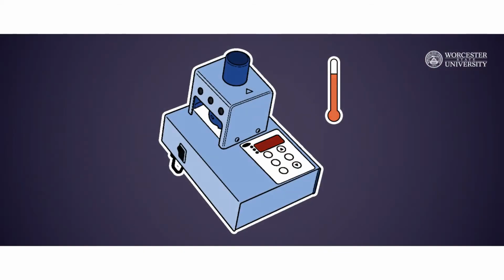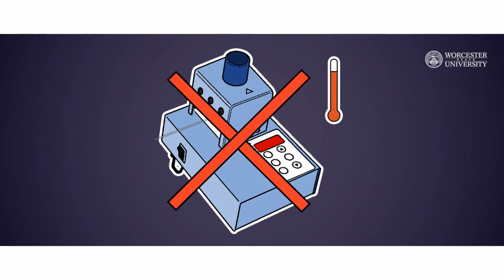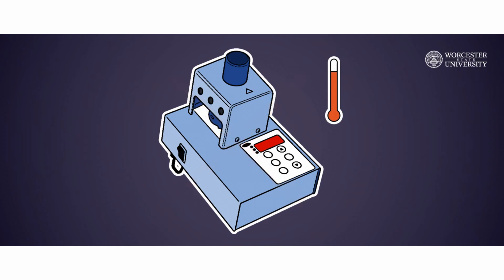If you want to continue using the apparatus for another trial, you should let the apparatus cool down properly. Once it cools down, you can restart the process. Remember, don't insert a fresh capillary tube into a hot heating block. This can cause the displaying temperature to deviate from the actual temperature of the sample. What you should do is let the apparatus cool down to at least 30 degrees Celsius below the melting point, then insert the tube.